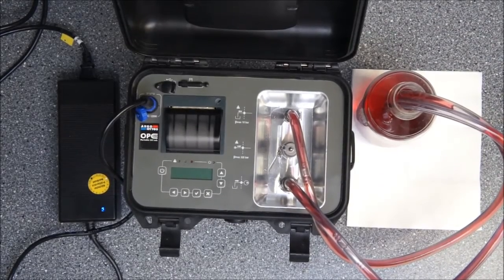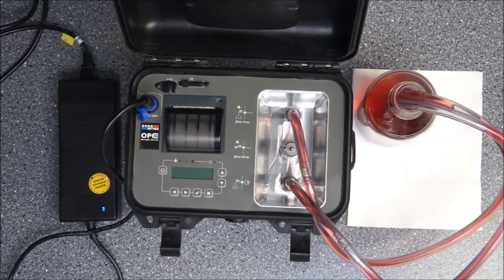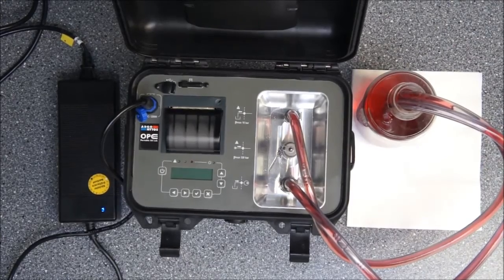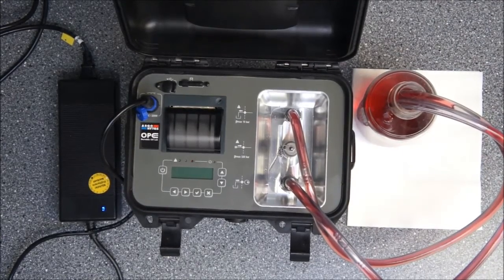Hello, my name is Roman Kroening and today I want to demonstrate our oil quality unit, the Opcom Portable Oil Lab.